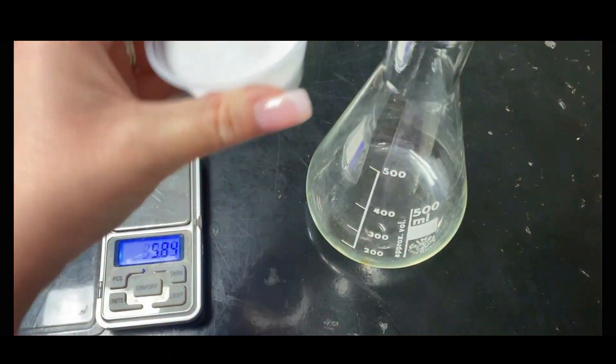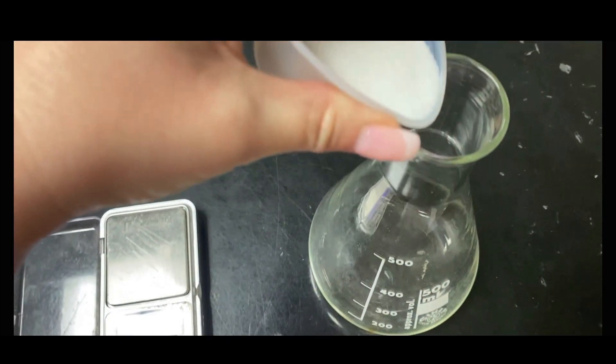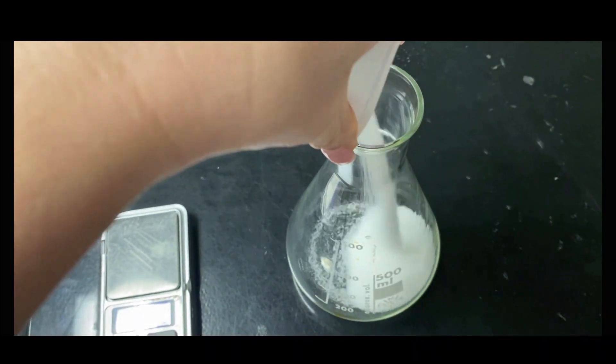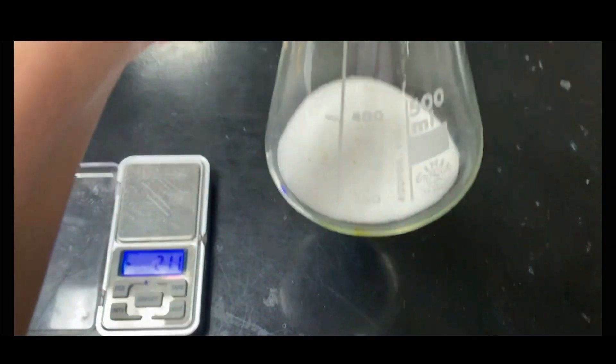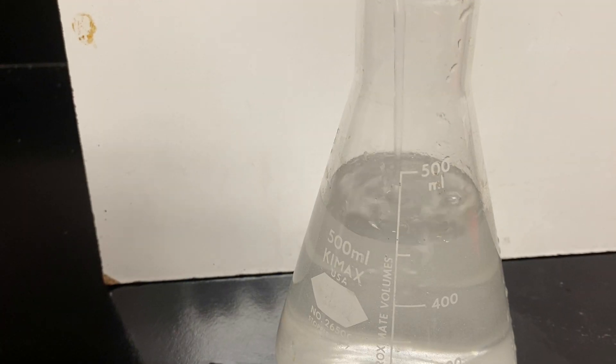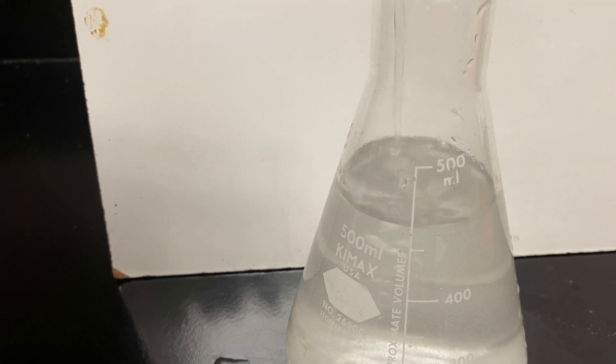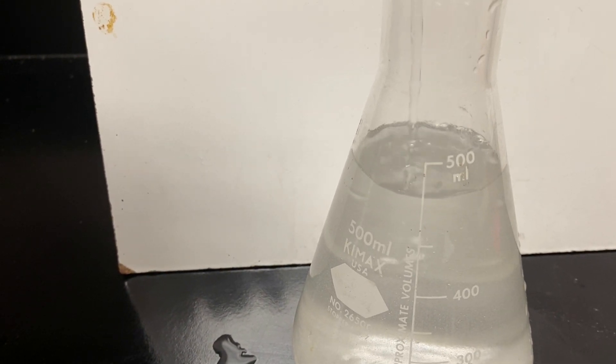So once I get that measured out, I'm going to put it in the bottom of my flask. A round bottom would be perfect for this but I don't have one, so a flask is the next best thing. And then you're going to fill it up to 0.5 liters, which is equivalent to 500 milliliters of water.